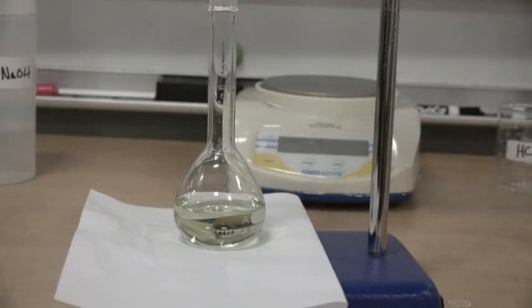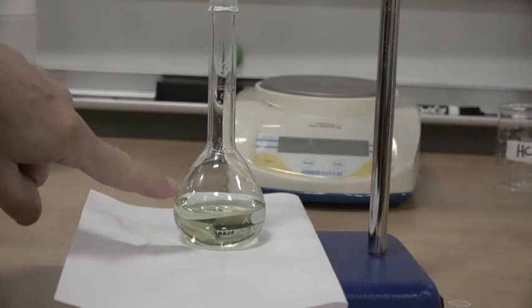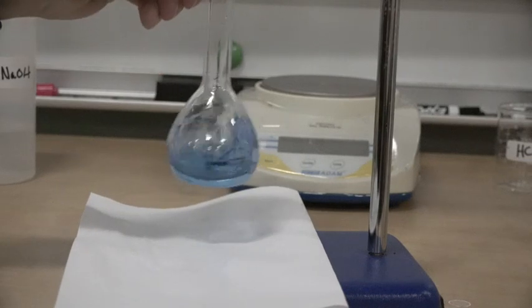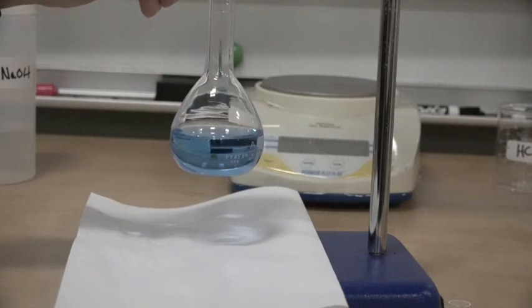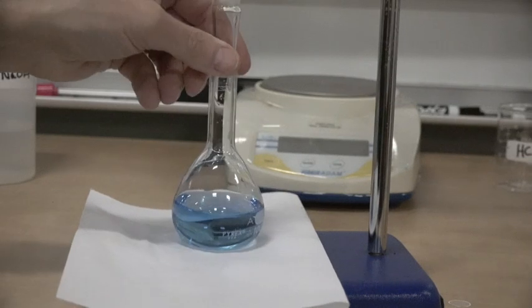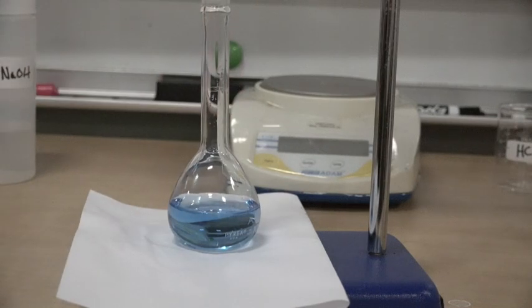The burette says 25 mils of base is used. So I'll put that up on the board in a second. But watch what happens if I put too much base in here. That's neutral right now. If I put too much base in, that's what happens. It turns blue and it won't go back. Okay? So, we were perfect with our titration.